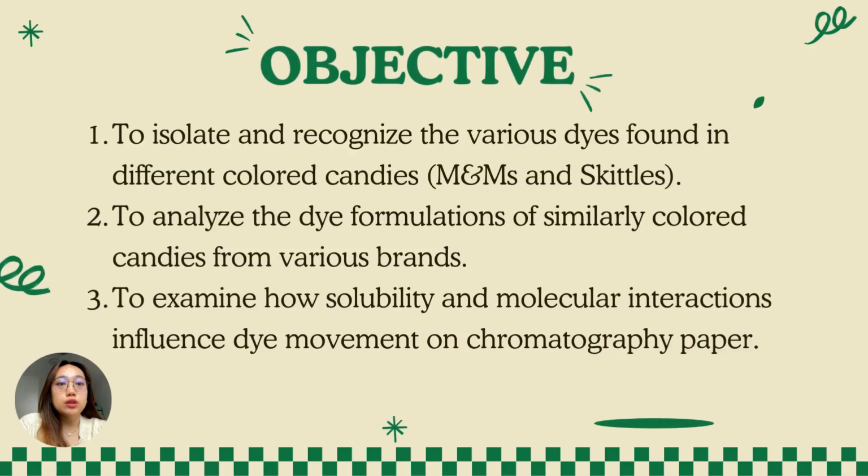The objective of our video presentation is to isolate and recognize the various dyes found in different colored candy, which in our case we have chosen M&M and also Skittles. Next is to analyze the dye formulations of similarly colored candies from various brands, which again are M&M and Skittles. And third is to examine how solubility and molecular interaction influence the dye movement on chromatography paper.